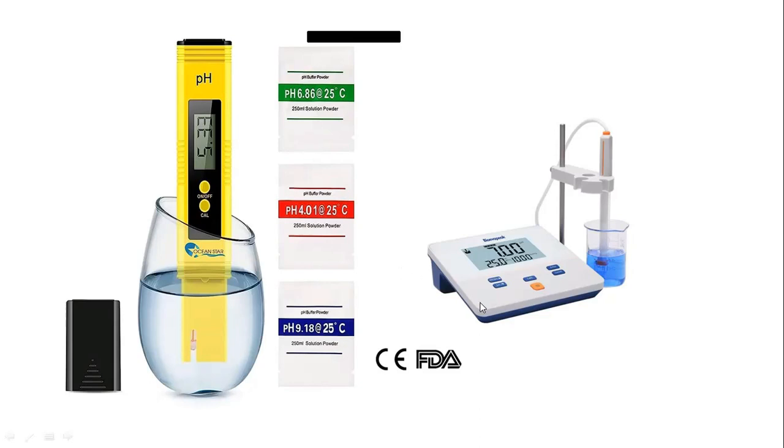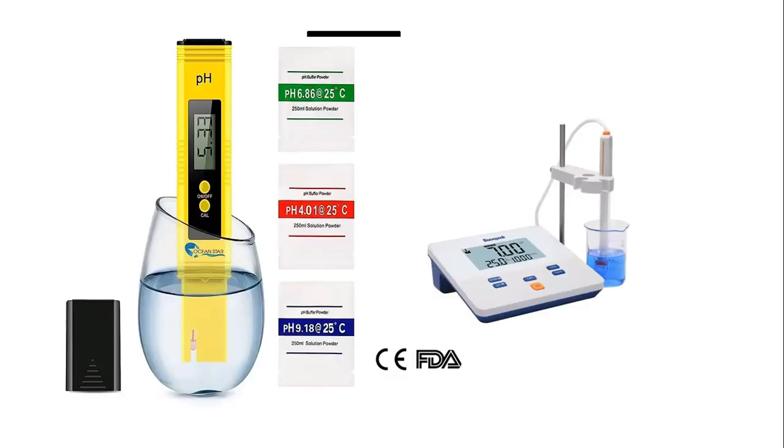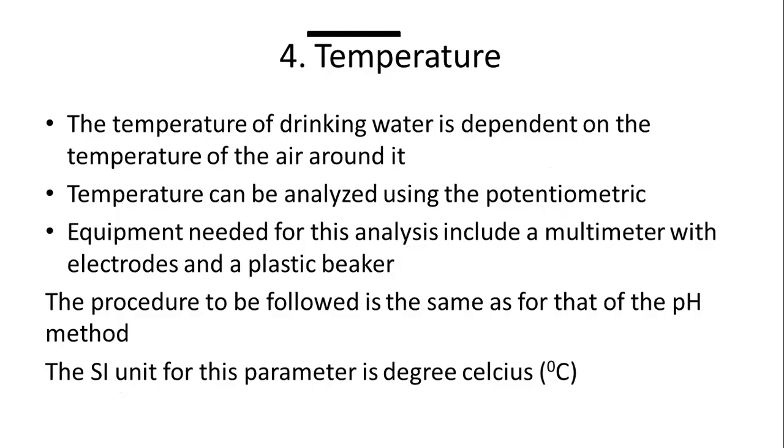As I mentioned earlier, a pH scale of 6.5 to 8.5 is the WHO recommended standard for drinking water. What you have on there is a pH meter and a multimeter, sorry. We can move on to the next.